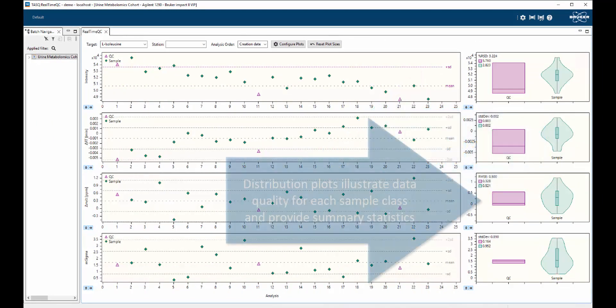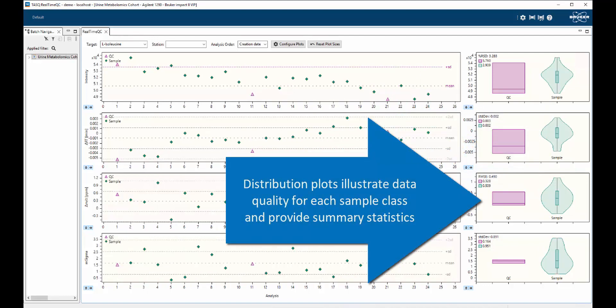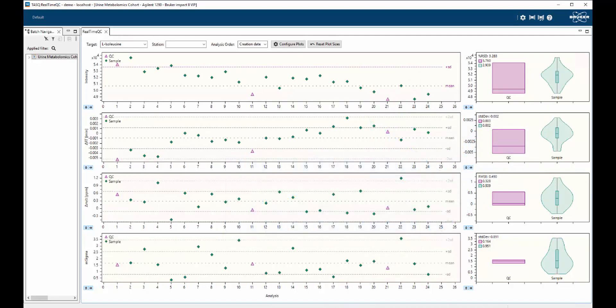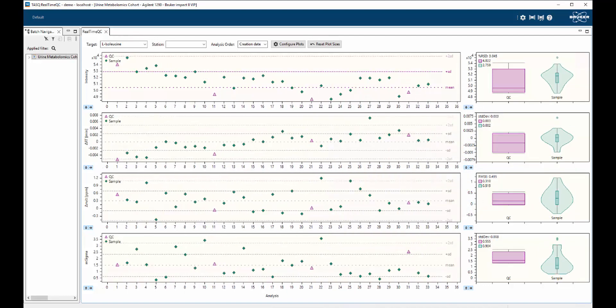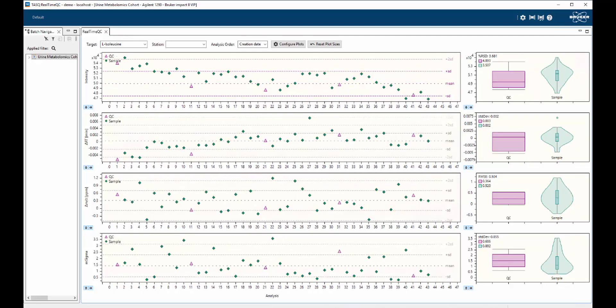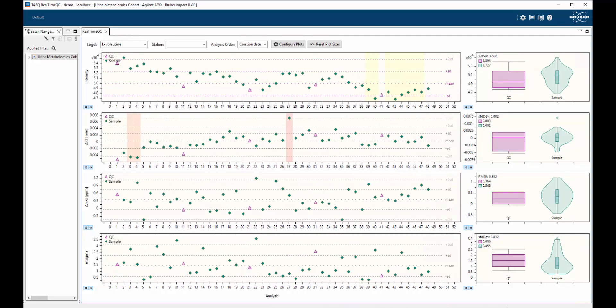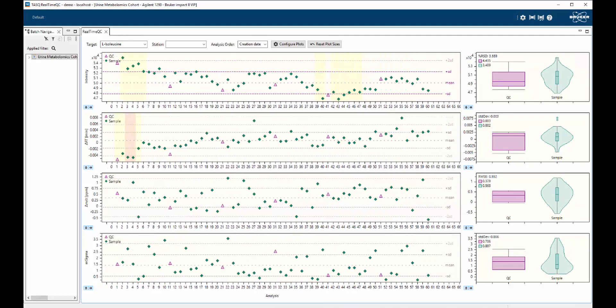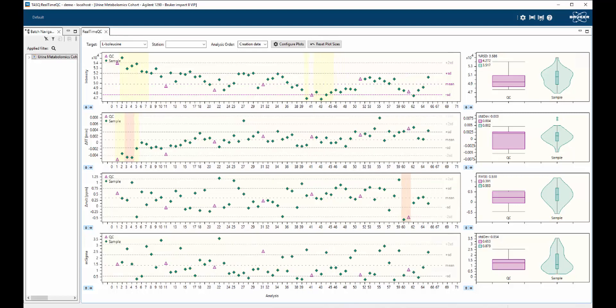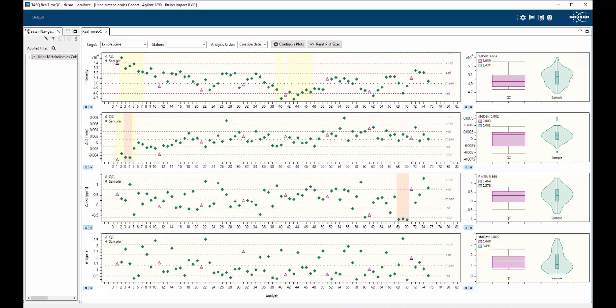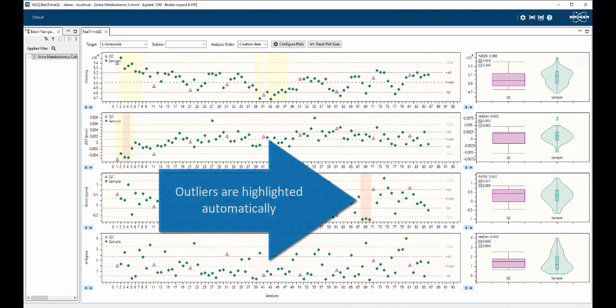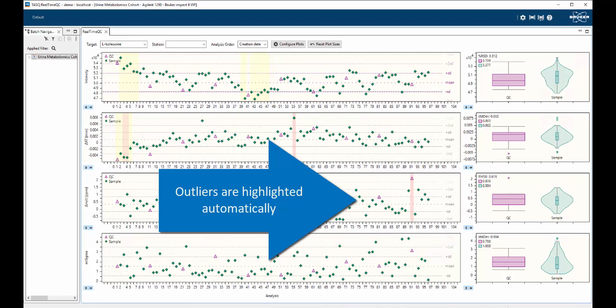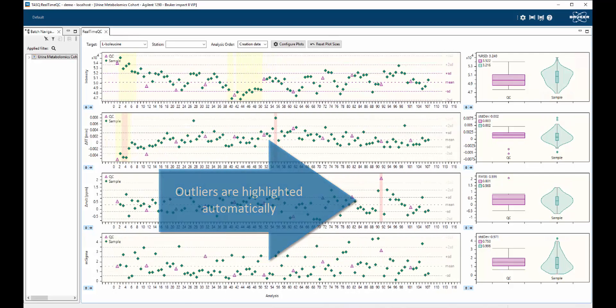With each completed sample analysis, Task Real-Time QC will update the display with measurement data specified by the user. Here, we are tracking LC peak intensity, retention time, M over Z accuracy, and isotopic distribution for the QC analyte isoleucine.